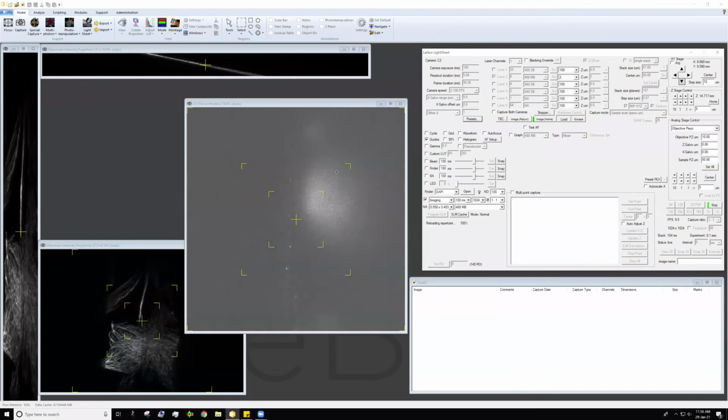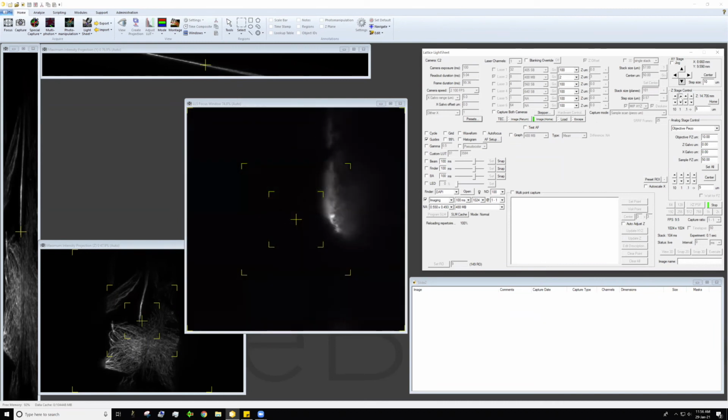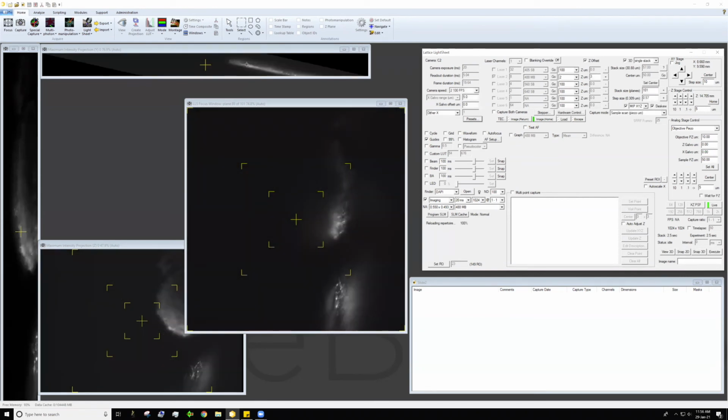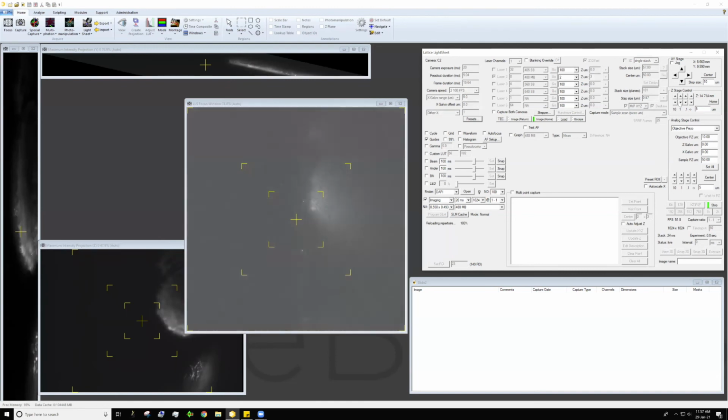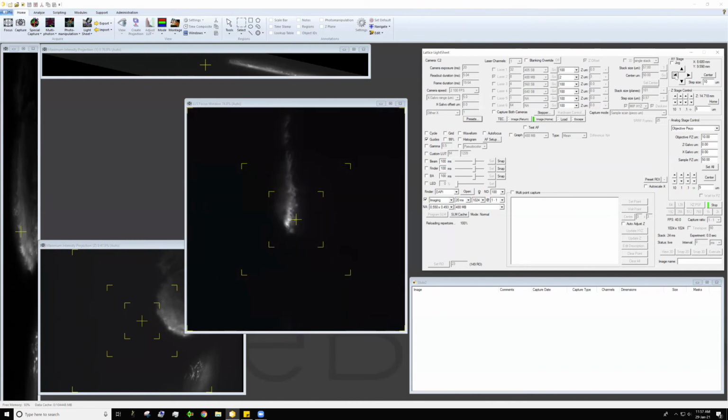To view something which appears to the right of the sheet, do not move the sheet to the right by clicking up in Z, as this will put your sample too high in the volume and you may lose data. Instead, with the sheet in the middle, move your sample to the left to meet it. It is likely that you will see a different plane of the cell now. Make the correction in Z by moving with the down arrow above the 1.